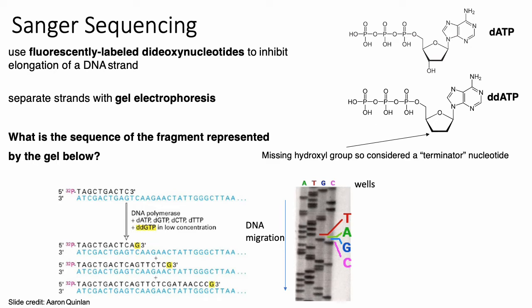The idea is that in this Sanger sequencing setup, you have 4 different chambers where in each chamber you only add one of the dideoxynucleotides. So in each chamber, you're only stopping the chain at one specific predetermined base. After multiple rounds of elongation, you end up with a whole collection of fragments of different lengths. These double-stranded DNA fragments are denatured, and then you size sort them using gel electrophoresis.